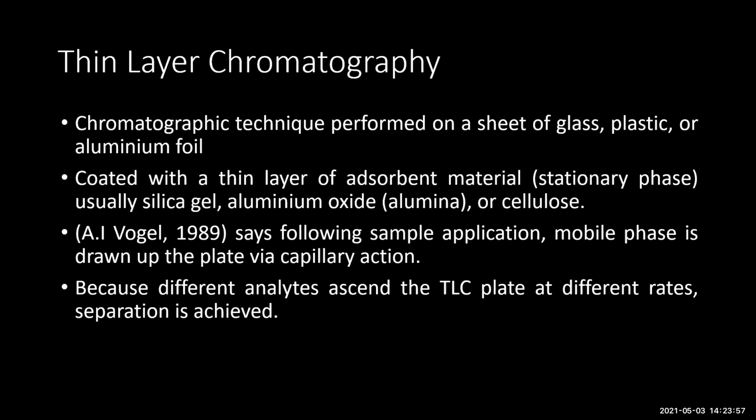If the molecule is structurally bigger or has a higher molecular weight, it will obviously be slower to ascend compared to one with lower molecular weight. Many things come into play, but that is the basic difference in principle. One moves along with the mobile phase because of the distribution coefficient. In here, it is the ability to ascend.